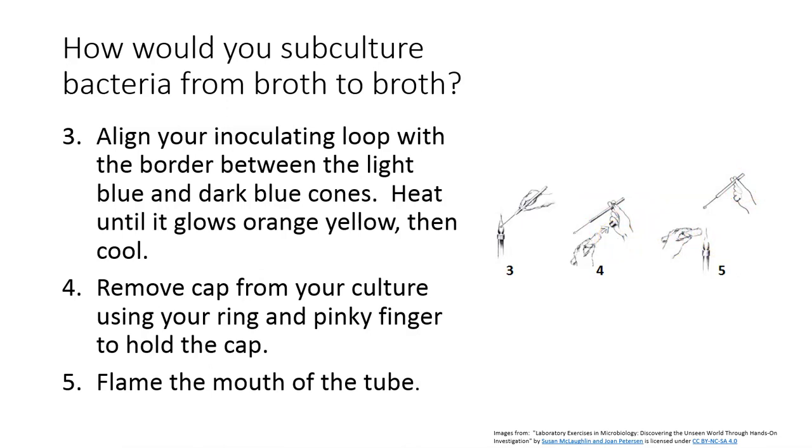I just feel like the cap is more secure. However you hold the cap in that hand, you want to make sure that the mouth of the cap is facing downwards so that microbes don't fall in, and then you run the risk of contaminating your experiment with those microbes. After you've removed the cap, you're going to want to flame the mouth of that test tube.